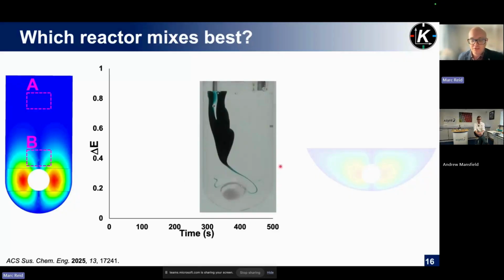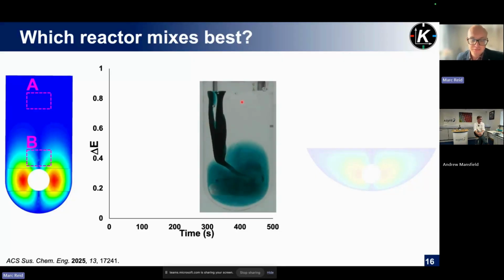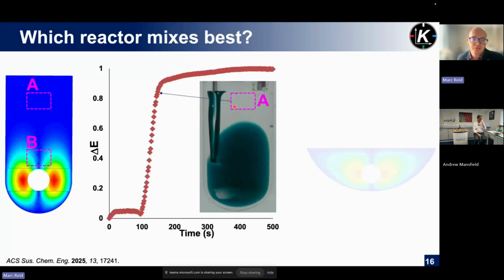So watch what that looks like in real life for this dye injected into the Schlenk tube holding a deep eutectic solvent. You can see in the time that I'm narrating here that mixing is reaching homogeneity around the stirrer, but it's far more sluggish as you approach the surface of the Schlenk tube. And important for mixing and Kineticolor, it's not simply a case of pointing at one region of interest and quantifying the colour change over time. We can look at multiple regions to understand the spatially resolved impact on mixing for different cases.